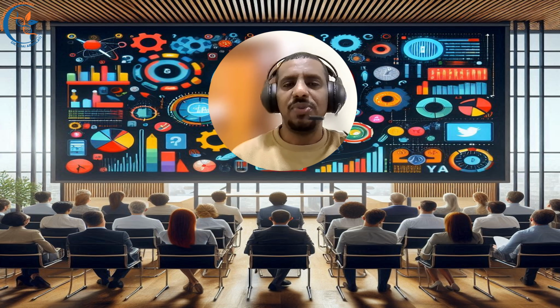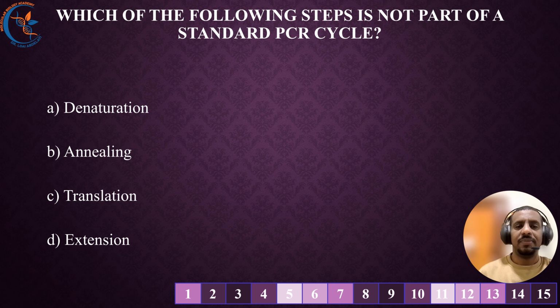Alright, now let's move to the question part and let us see the first question we have today. Which of the following steps is not a part of the standard PCR cycle?